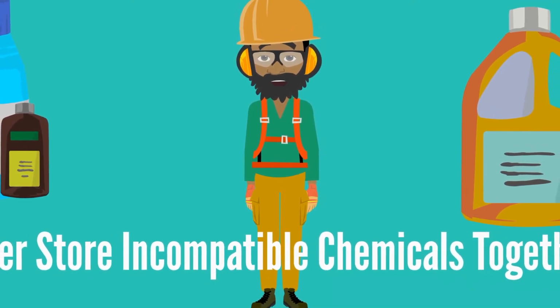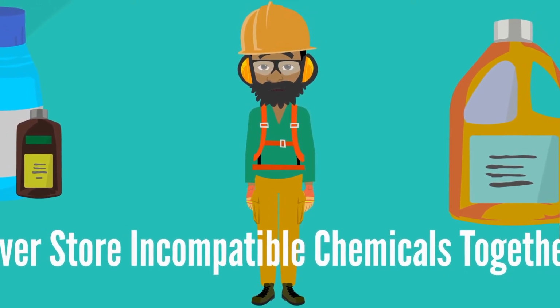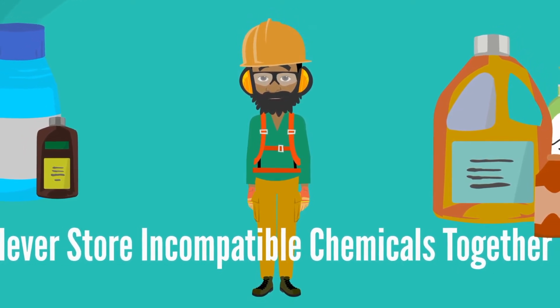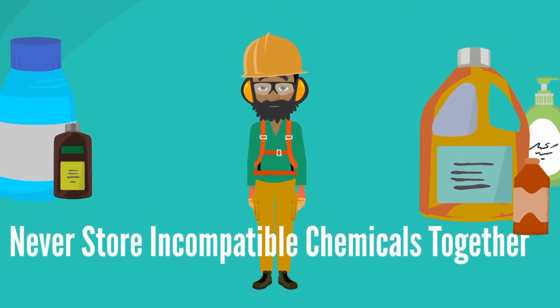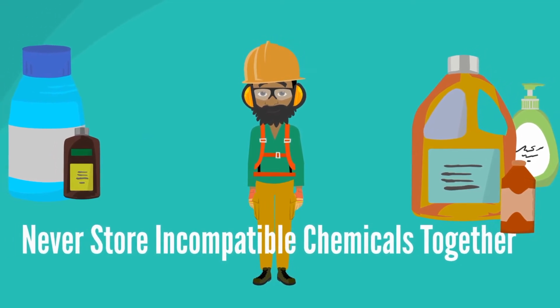Do not store chemicals alphabetically unless they are compatible. Store flammable liquids in an approved safety container in a flammable storage cabinet. Segregate acids from bases. Segregate most organic acids from oxidizing mineral acids.